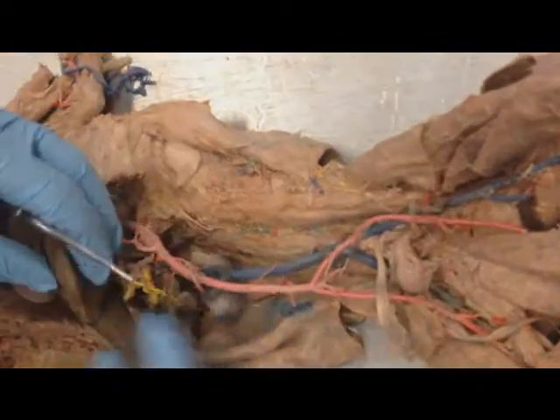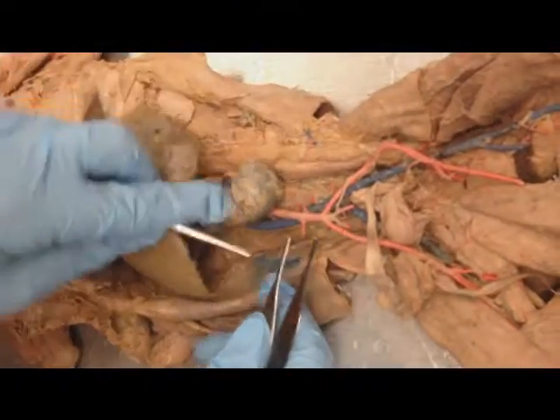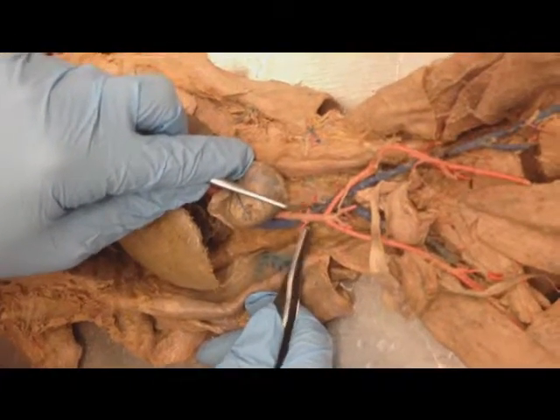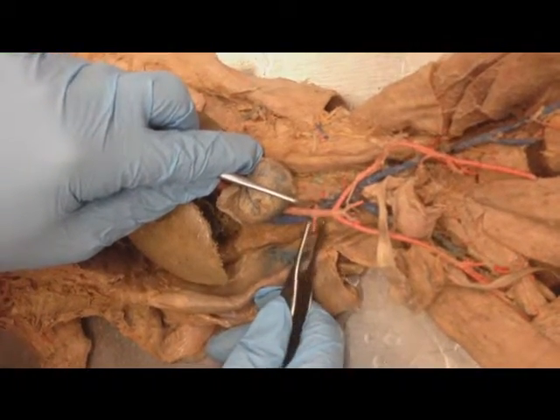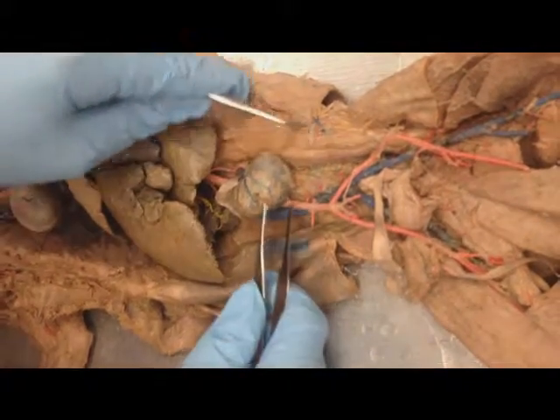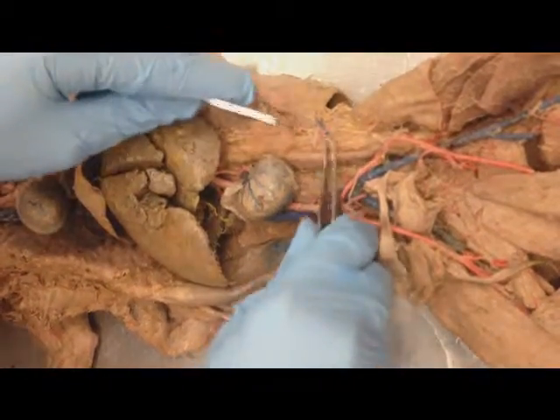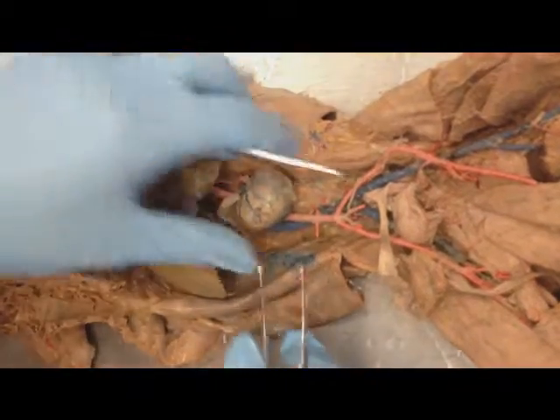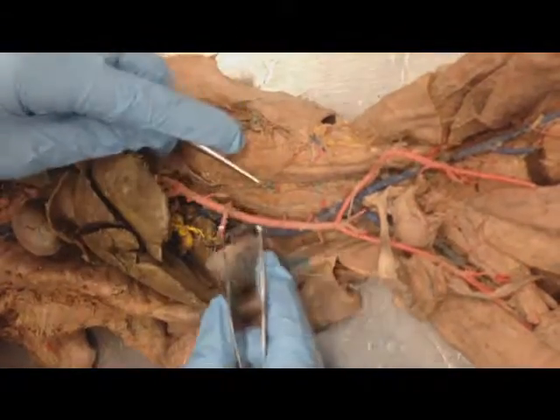So if you go up, this cat doesn't have any particularly good iliolumbars, but they are a paired artery, and they often extend to this region over here. So perhaps they once extended here and connected. Those are iliolumbars.